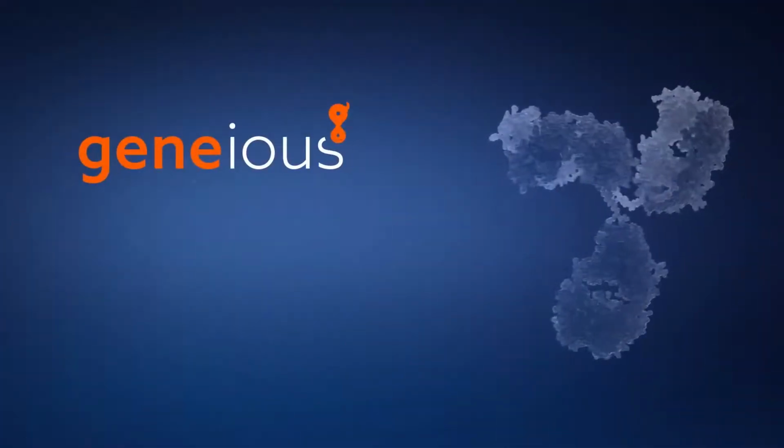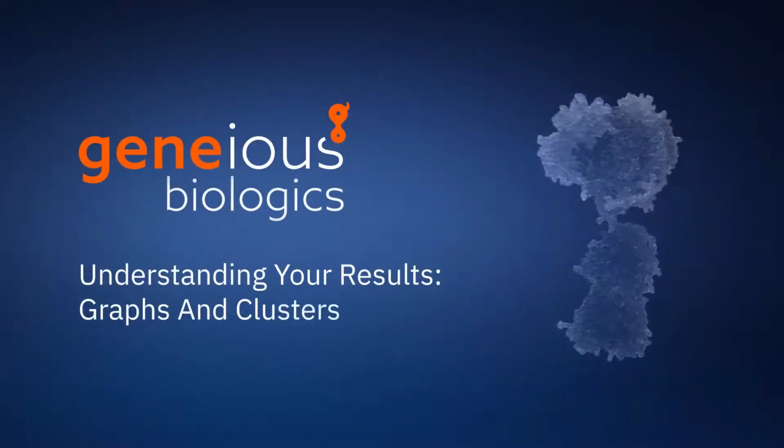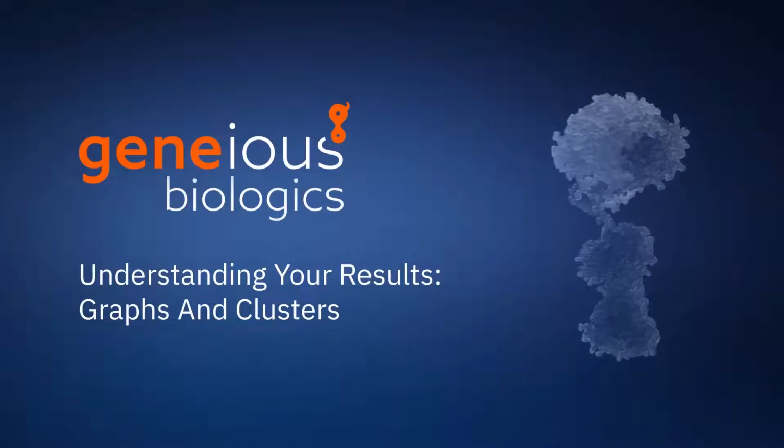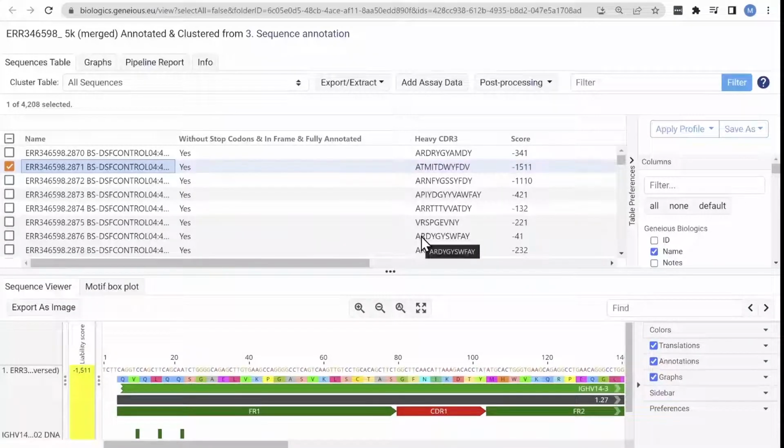Welcome to this Geneious Biologics tutorial video on understanding the pipeline report, navigating the Graphs tab, and understanding and visualizing clusters in your data. After you've run the annotator tool, the results will be visualized graphically in several ways. To learn more about the annotator tool, see the annotation video in this tutorial video series.